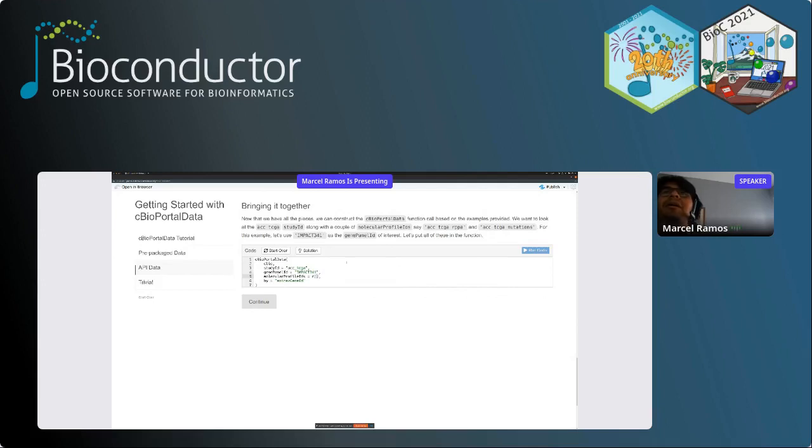You can again use your set of genes as well, and a couple of molecular profile IDs, RPPA and mutations. So I'll copy those over. So that goes under the molecular profile IDs input. And then we want this by Entrez gene ID.